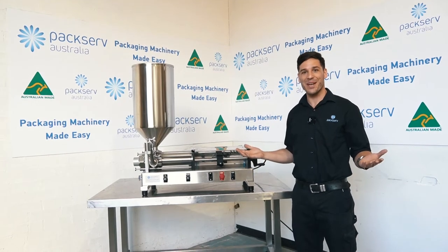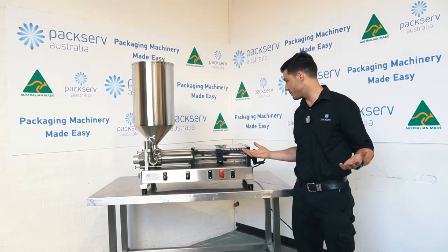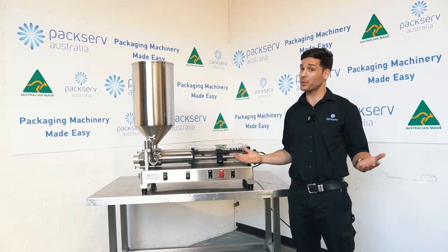That's a quick rundown of the PFM3 and all the buttons. Any other details, have a look at the manual.